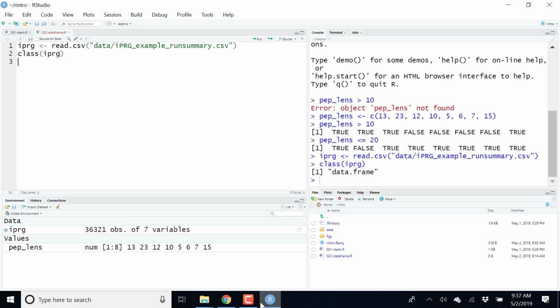But it's important to have this notion that whether it's this tidy data or this wide data, they are still structured. And we know exactly that if we take one column here, we get all the intensities of one sample, but if we take one row, we will have that protein and all the intensities across all the samples.